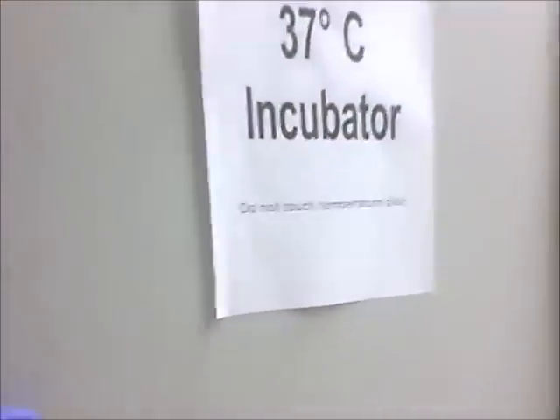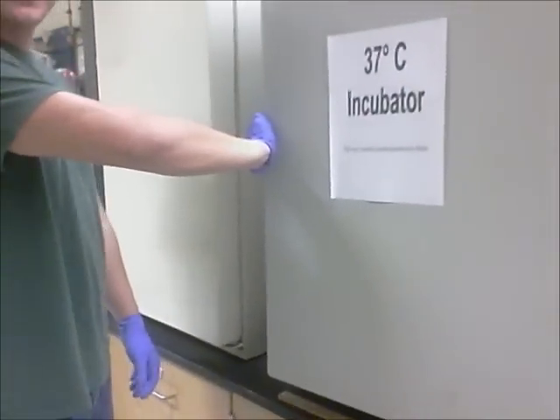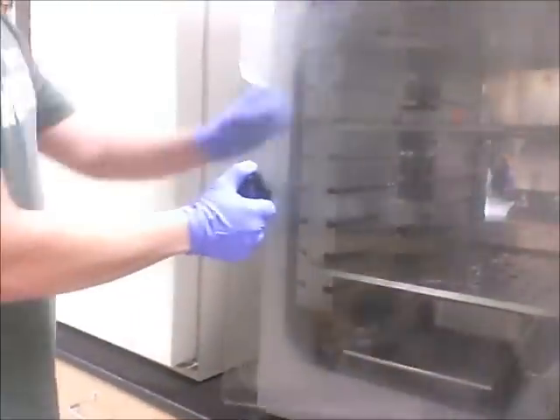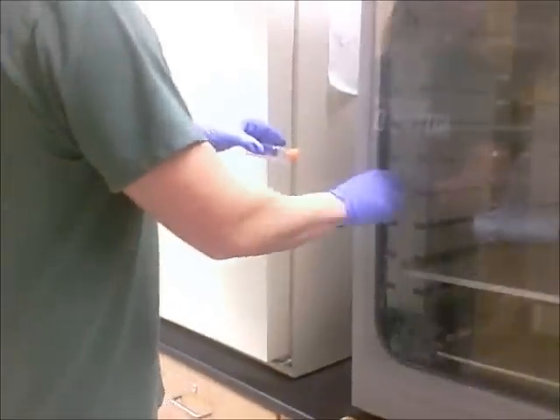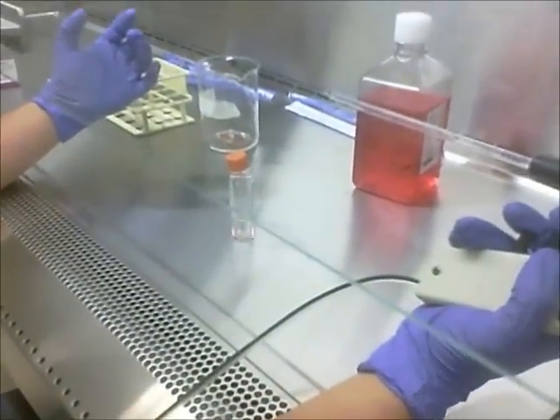Next we're going to take the cells and place them in the 37-degree incubator for about 10 to 20 seconds, which is going to help the cells detach quicker. It's been 20 seconds, so we're going to remove the cells from the incubator. Just before we remove the trypsin, we want to make sure the cells are starting to detach, so we look at them under the inverted microscope. We can see that they are now moving, so it's okay to go ahead and remove the trypsin.